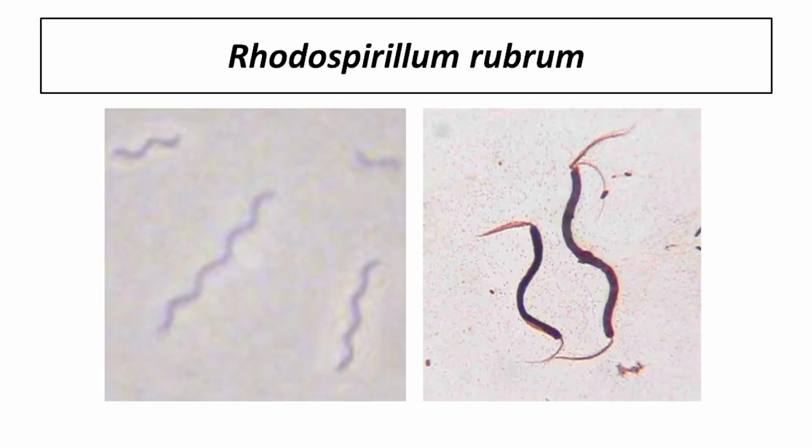Lastly is Rhodospirillum rubrum. You guys can see it's got the nice little squiggle shape. So this is a spirilla example. And it's got little flagella on there on the end, so it'll be actually very motile. It'll move around. It won't stay in one place. So it's important to remember that that's one of the contributing factors to why some things are random and other things only have one certain type of arrangement. This one's random because it's always moving around, and it's that spirilla squiggle shape.